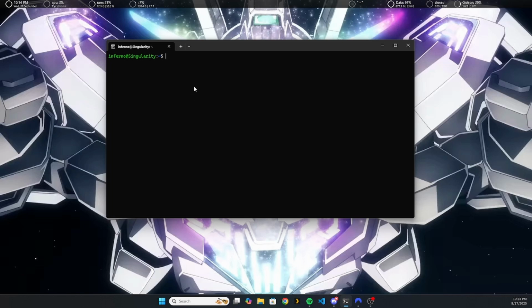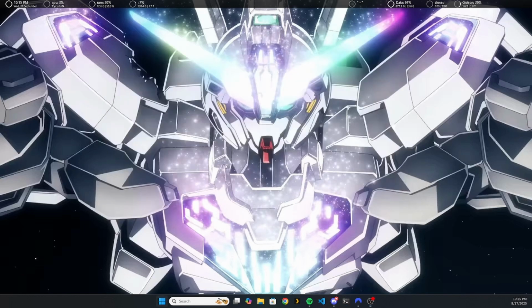So I don't think I've installed Conda yet, which is great. And so we're going to go and download it. I actually think it's on my other one. I'll link to where you can download it. I won't necessarily go through the whole thing because it's essentially just a bash script. However, with that, let me go ahead and open my other one.